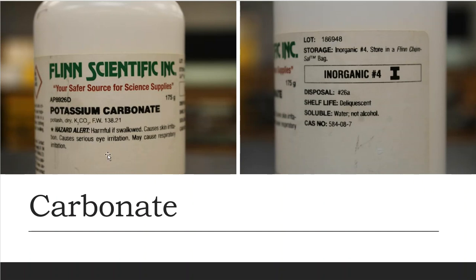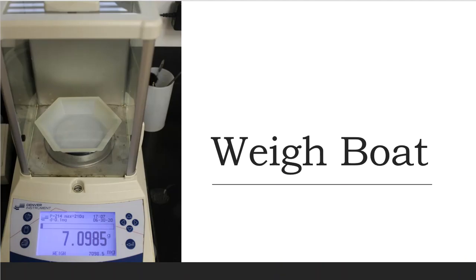I'm going to take this potassium carbonate, and the directions tell me to make a solution of potassium carbonate. Well, that solution, unlike some of the others, they just basically tell me how much to weigh out. That's all that they do. They just say, you need to weigh out this and add it to that flask. So I'm okay with that. That's less calculation that I have to do.